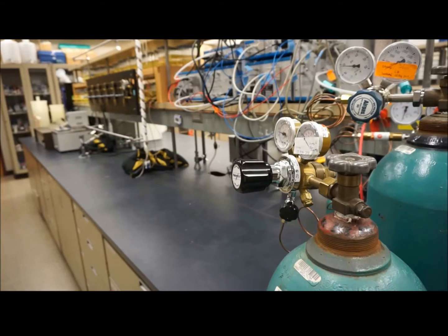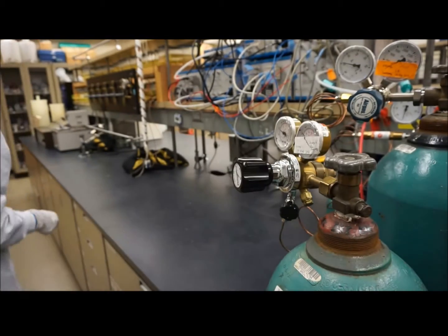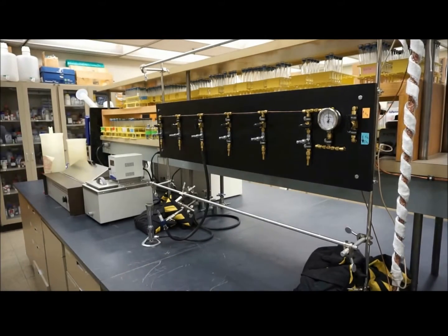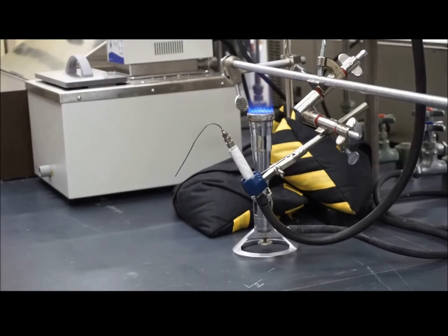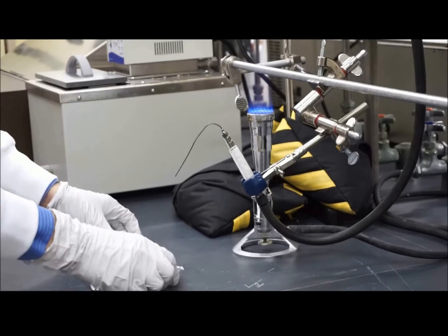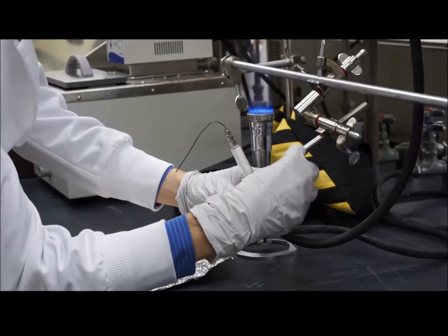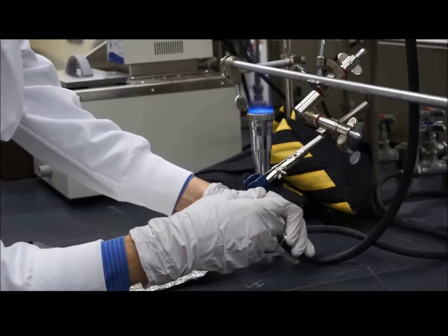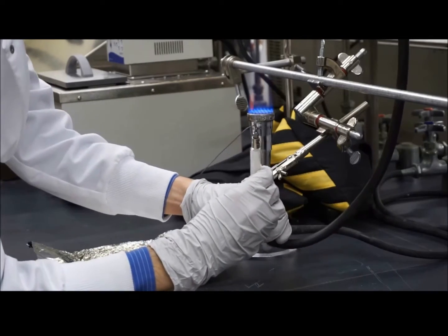To transfer an anaerobic culture, we first turn on the CO2 tank. Next, we turn on valves on the gassing station to start the flow of CO2. After that, we turn on the Bunsen burner, just as we do in aerobic microbiology. We retrieve a new gassing probe that has been autoclaved in aluminum foil in order to sterilize it. We remove the old gassing probe, which is no longer sterile. We exchange it with the new, sterile one.